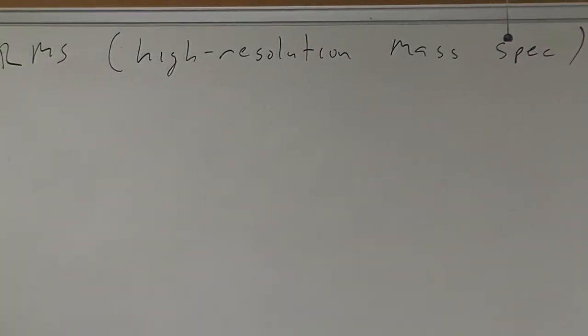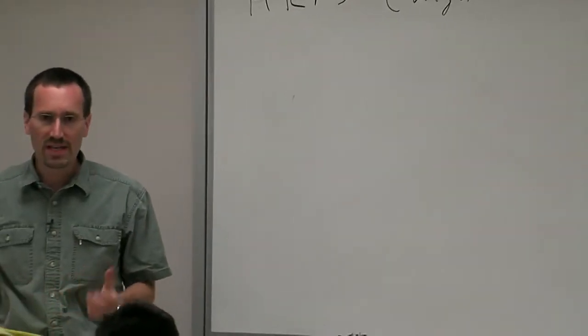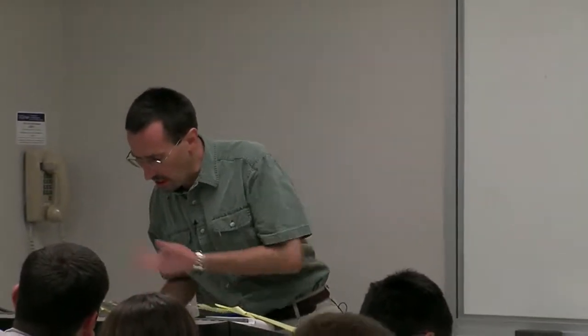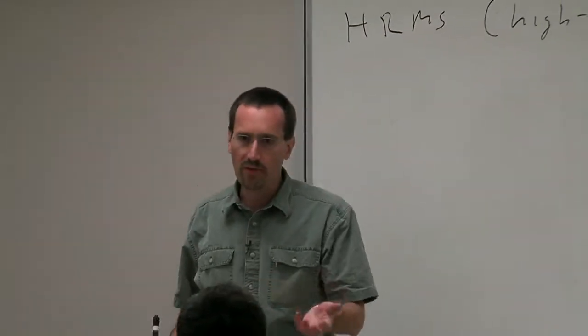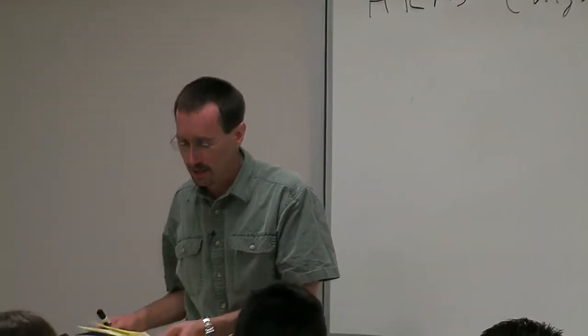In general, when you get a mass spectrum, the mass that you get is good to within a few tenths or a few hundredths of a mass unit. In other words, if you get a number like, in one particular exercise I'll show you later on in the homework, 1239.2, you might say, okay, that number 1239.2 is probably good to within a few tenths of a mass unit.